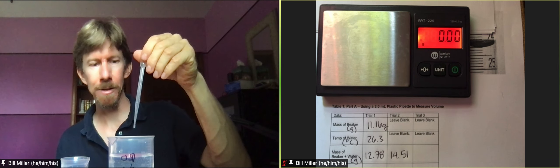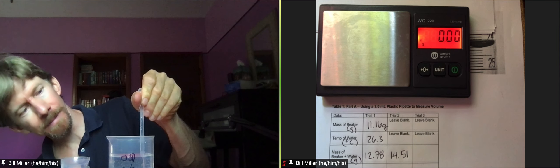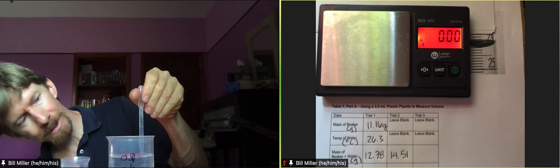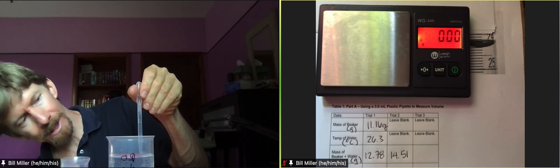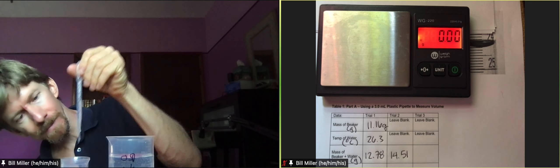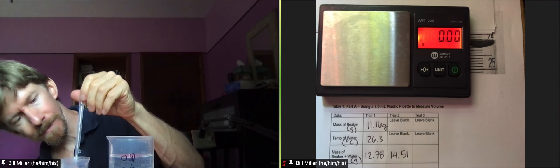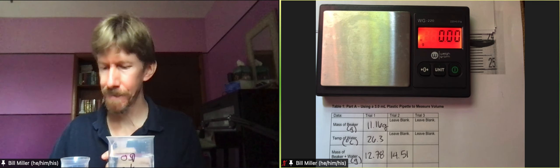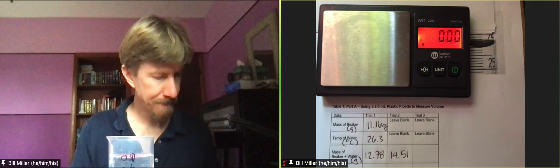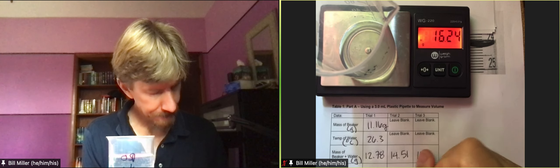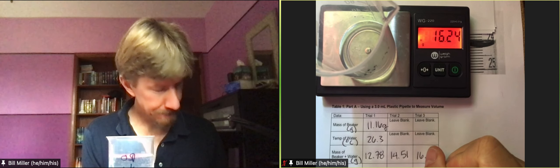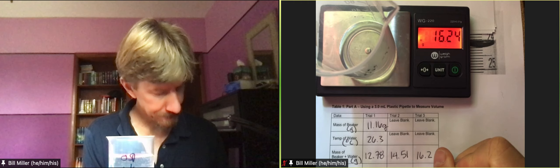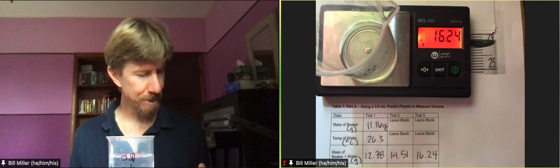This time I get 14.51, not emptying it. Again so squeeze it out, right to the two milliliter line, squeeze it out. This time I get 16.24.